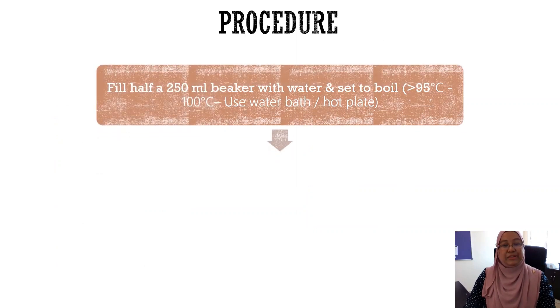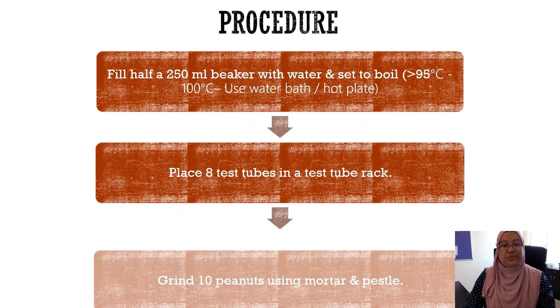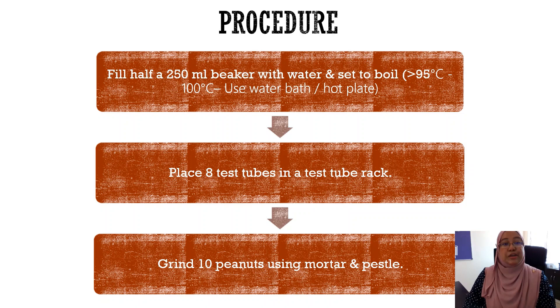Now let's have a look at the procedures. Fill half a 250 ml beaker with water and set to boil — make sure the temperature must be above 95 degrees Celsius. Place eight test tubes in a test tube rack and grind 10 peanuts using a mortar and pestle.